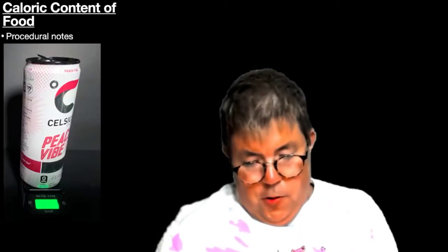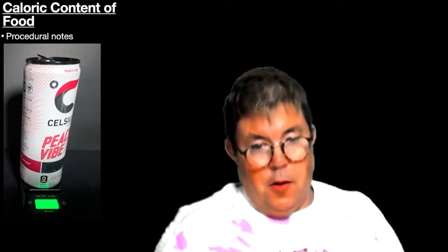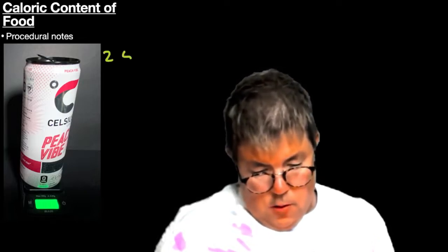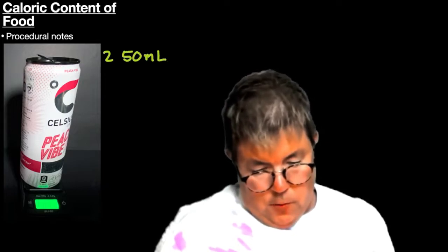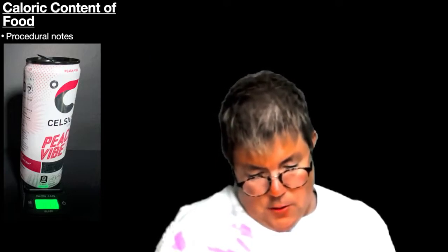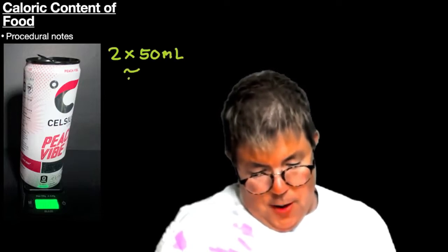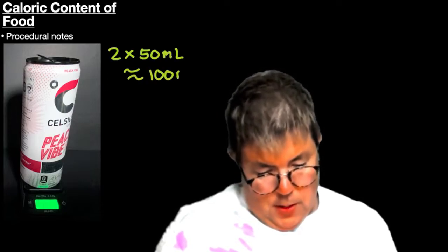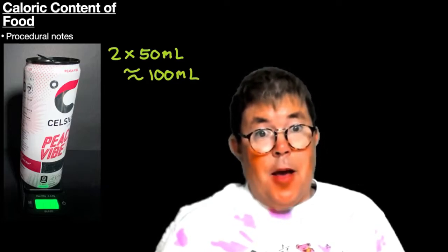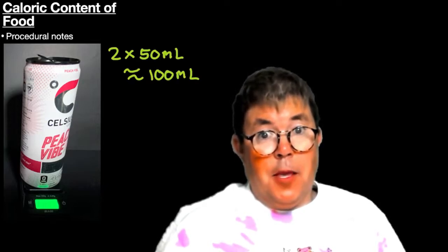The procedure states to take two 50 milliliter portions of water. Whoops. Let me rewrite this. 2 50 milliliter portions of water to get approximately 100 milliliters. I have added approximately 100 milliliters of water to the can.